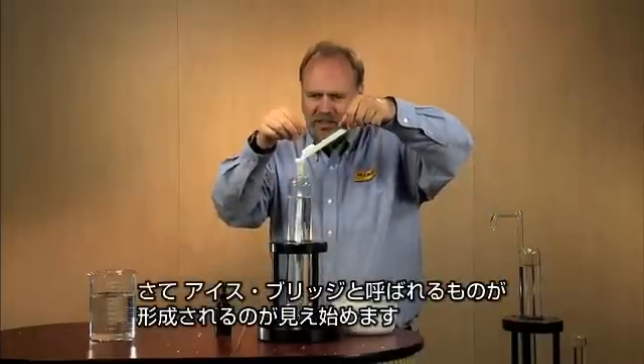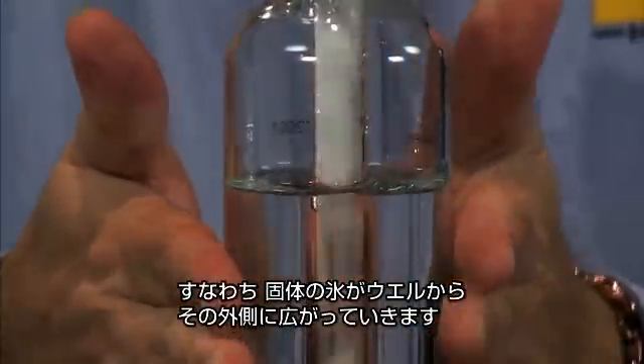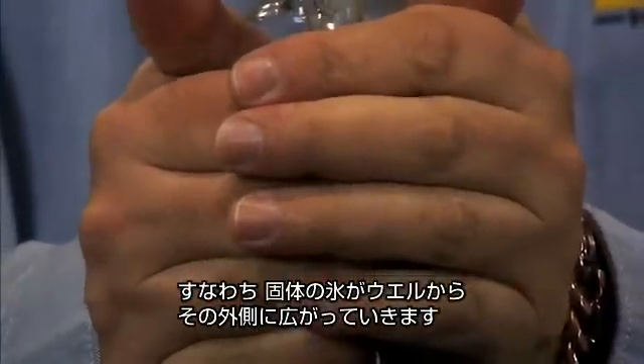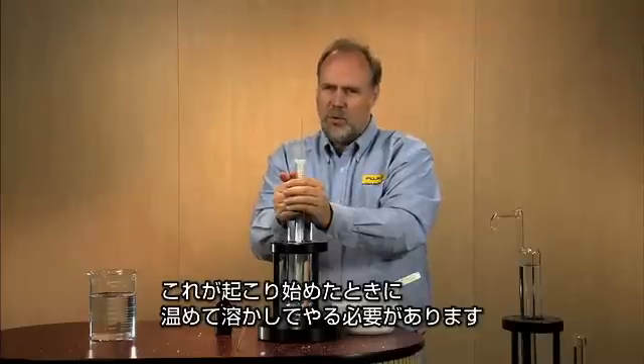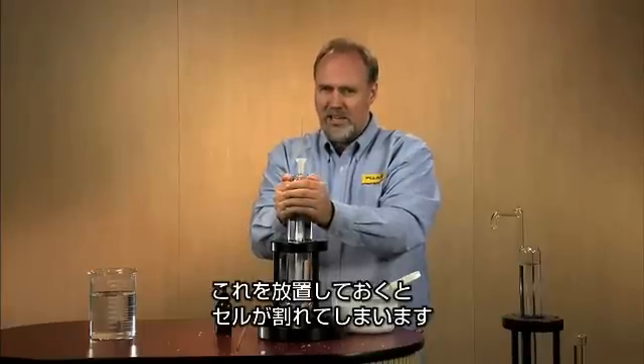Now I'm starting to see forming what's called an ice bridge, which means I've got solid ice freezing from the well right to the outsides. When that begins to happen, you need to warm it up and melt it away. If you let it go unchecked, it will break your cell.